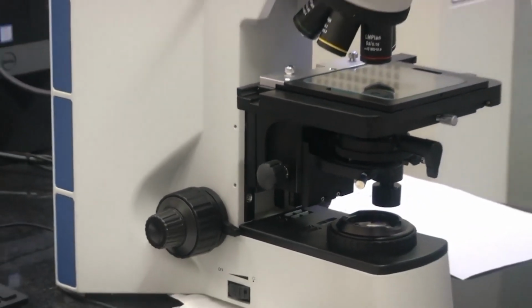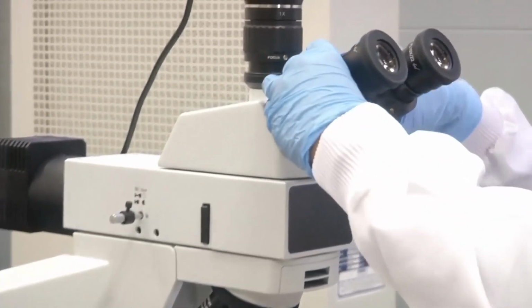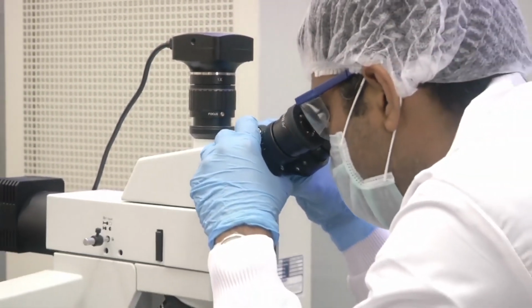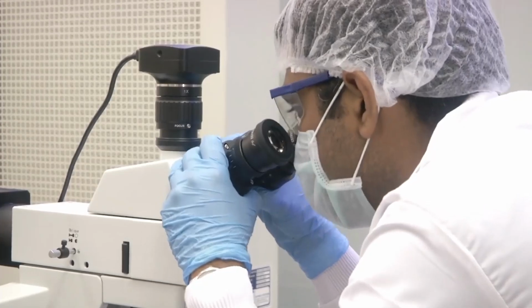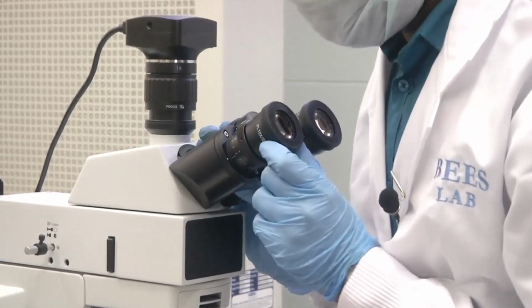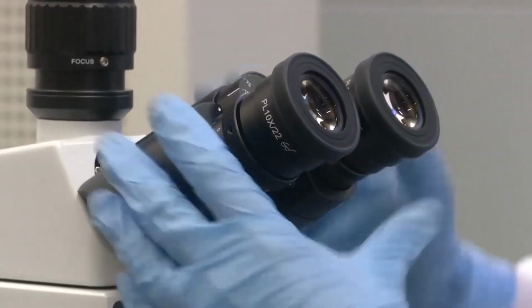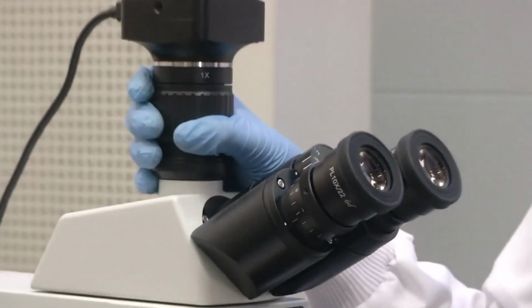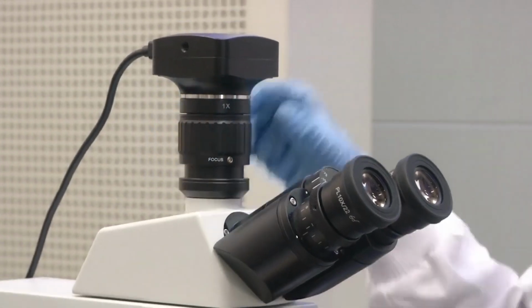Then this is the eyepiece. You can move this eyepiece around like this, so that it will suit your eye, whatever the shape of your eye, accordingly you can adjust your eyepiece. This eyepiece has 10x magnification, as you can see here. 10x is written here, and whatever is seen by the eyepiece is also captured by this camera. This is the camera.